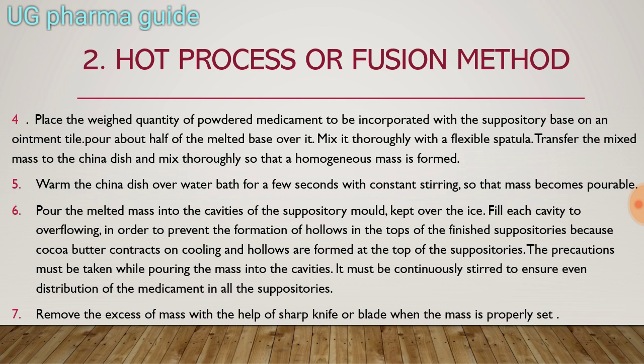With a flexible spatula, mix the medicament and the suppository base mixture. After that, transfer it to the china dish and mix it there so it becomes a homogeneous mixture. Warm the china dish over a water bath for a few seconds with constant stirring so that the mass becomes pourable.